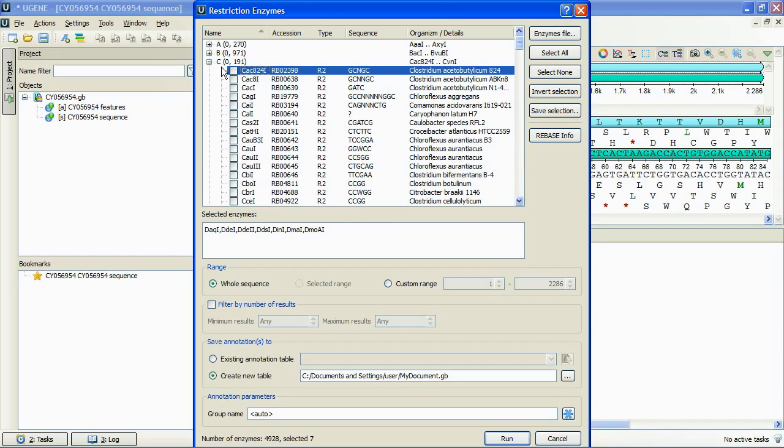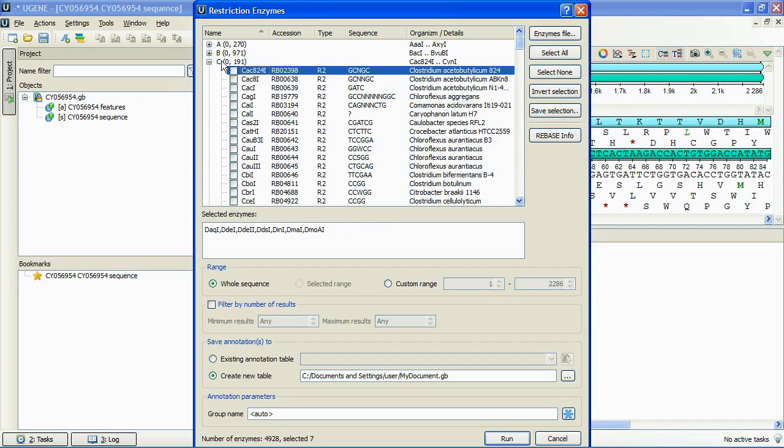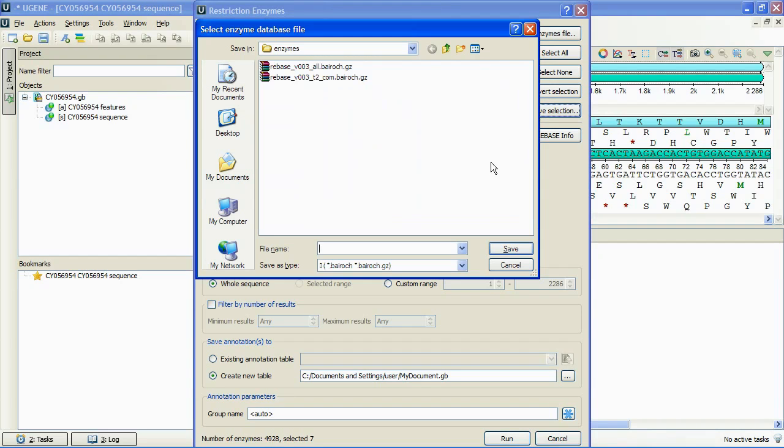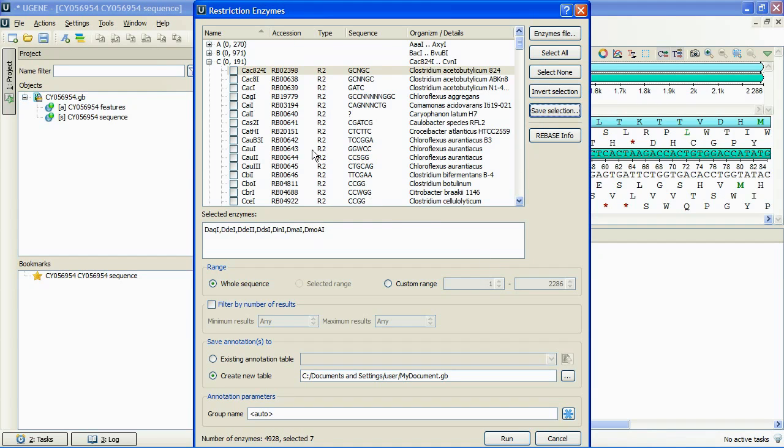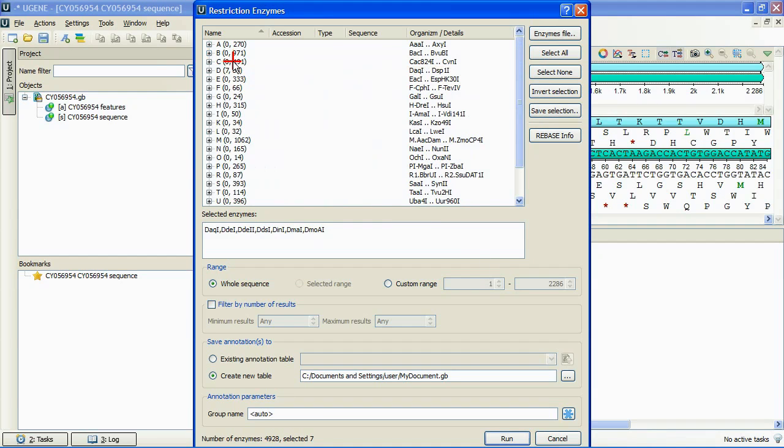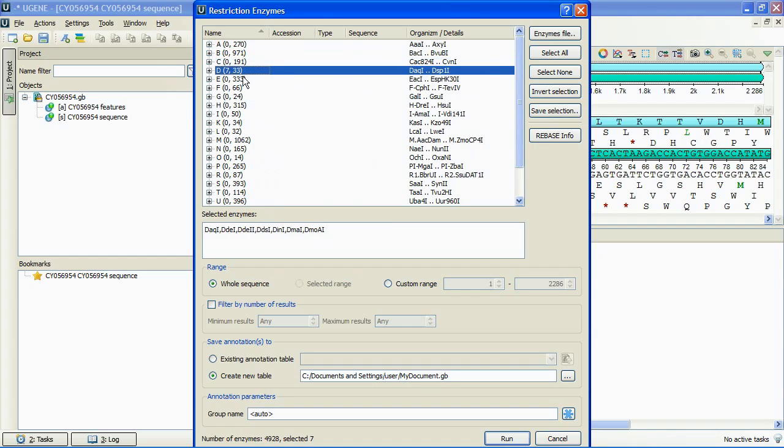Select All, Select None, and Invert Selection buttons help to specify the selection, and the Save Selection button allows us to save the specified selection for later use. The numbers after a group name is a pair of the currently selected enzymes number and the group capacity.